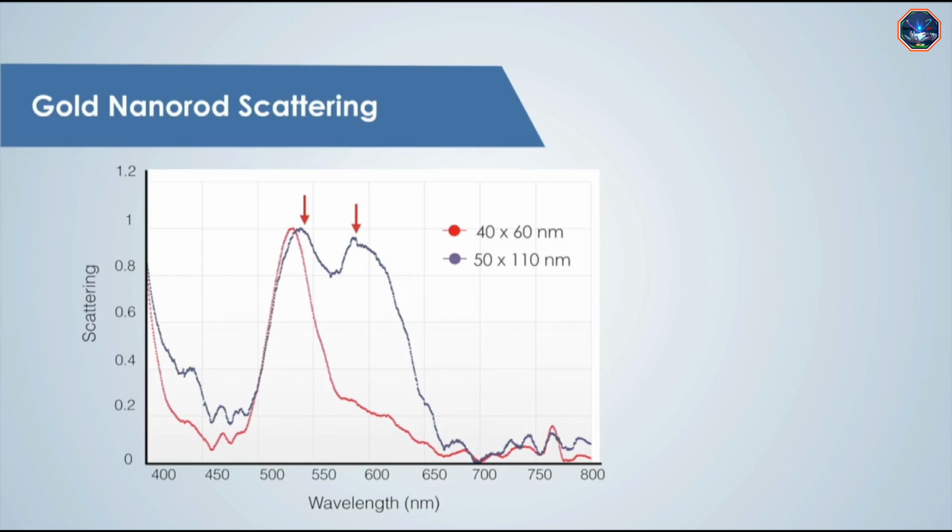Many applications, such as solar cells and chemical sensors, use nanoparticles like these, and scientists need to measure the reflectance spectra of the nanoparticles to make better solar cells and sensors.